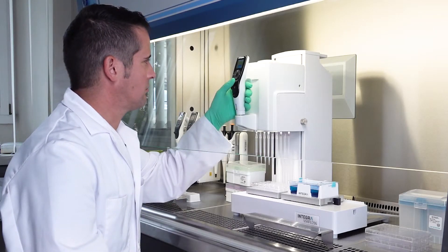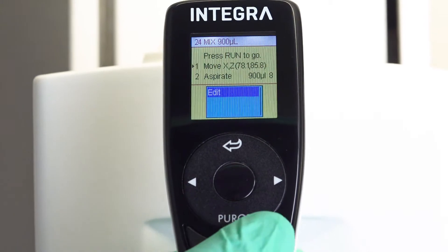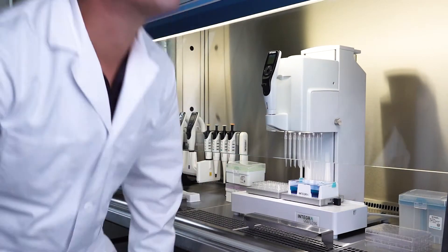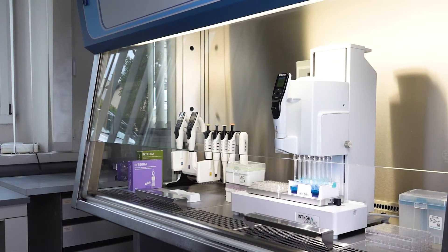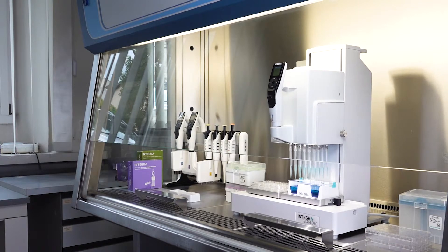Routine pipetting tasks can also be automated, for example when working in a laminar flow cabinet. This feature is especially useful in space-restricted conditions or to ensure a process is always carried out the same way.